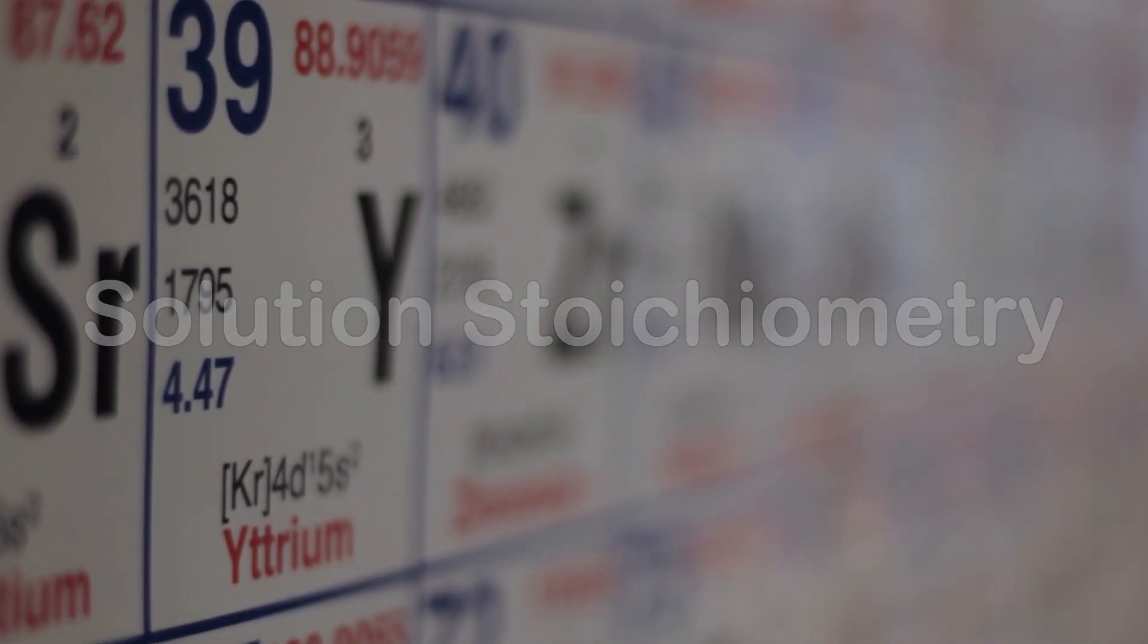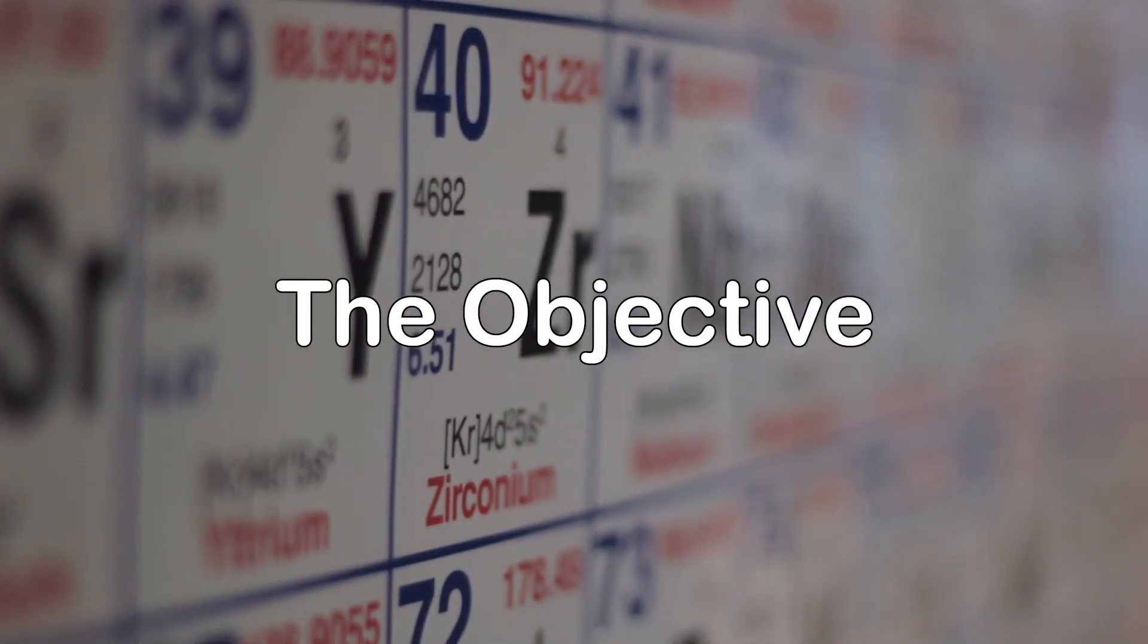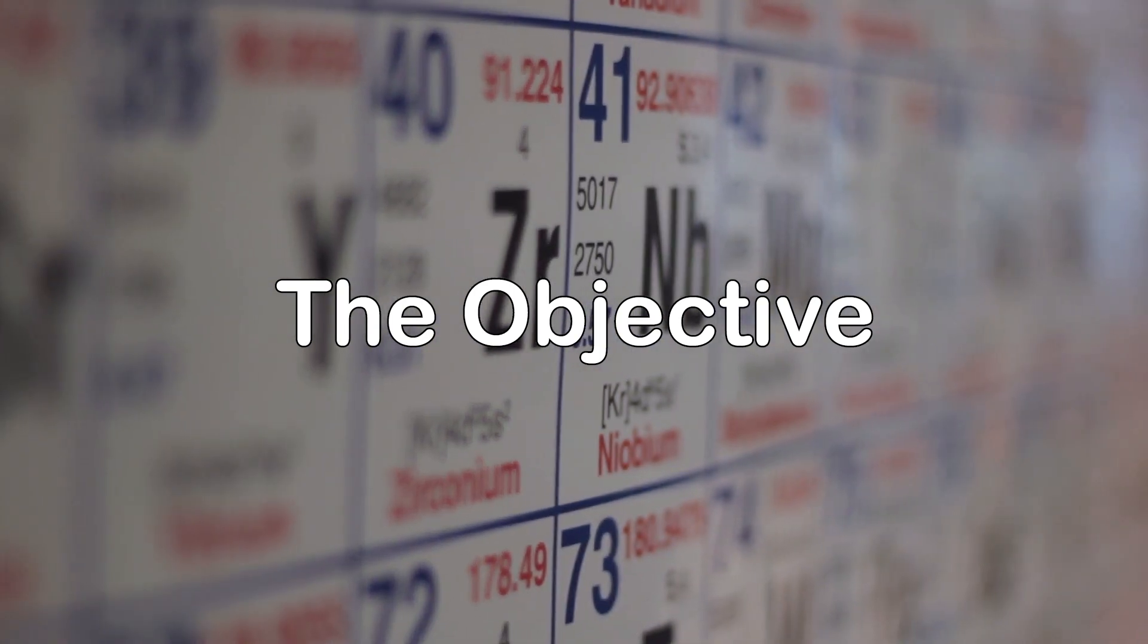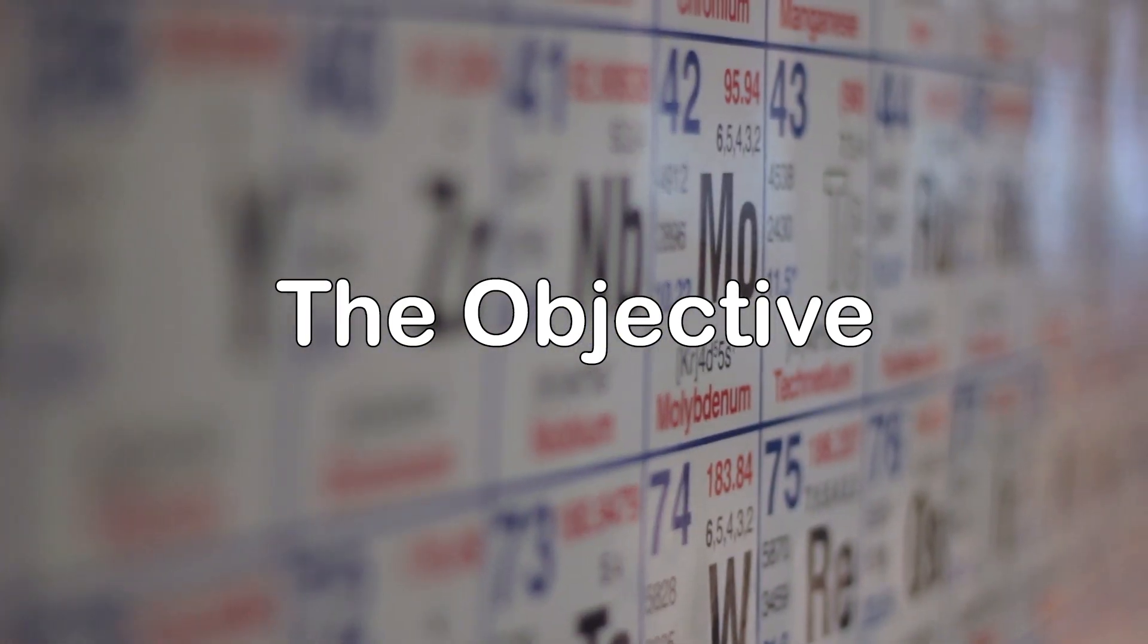Solution stoichiometry. The stoichiometry of a reaction between calcium chloride and sodium carbonate is carried out in aqueous solution and examined.